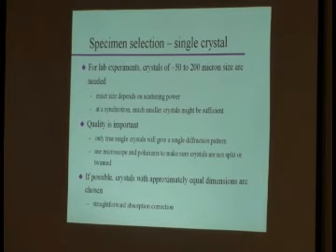Now, the computer doesn't have some kind of color labeling that says, oh, this was from one of the crystals that you have on here, this is from the other one. The computer doesn't know. The computer assumes you as the user know what you're doing, and you give it a single crystal. The computer will try to deal with all that data. And in many cases it will fail miserably. Okay, so most of the time when you don't get a solution, the reason for that is crystal quality. You didn't give your system a true single crystal.